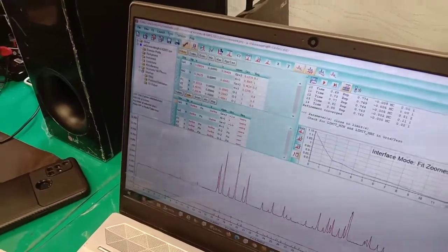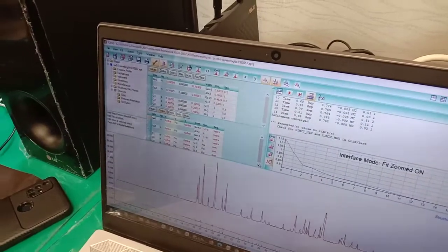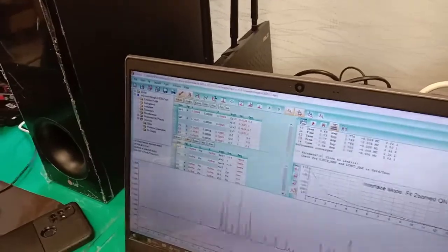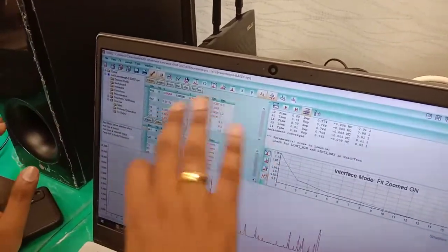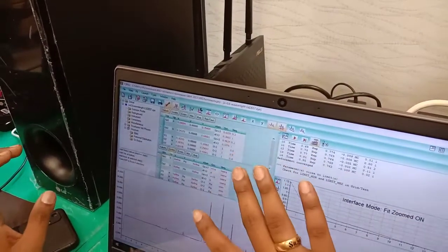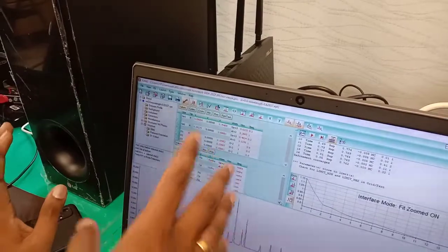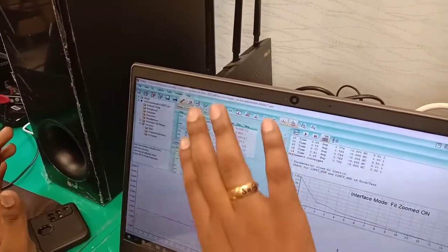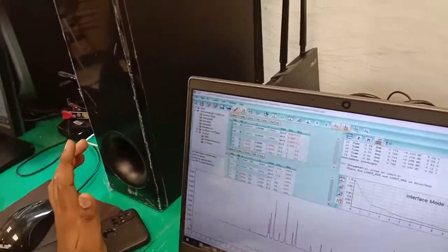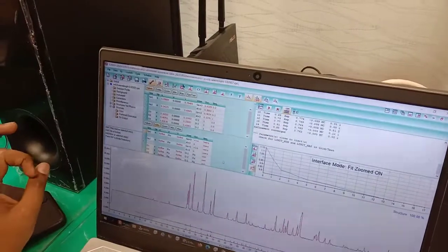Because everything has the same multiplicity, in this case I just refine it like this, because the OCC and the BQ are always highly related. So when I change the BQ, the OCC value will change. Sometimes based on our chemical formula we always set the BQ something like this, but I think it's fine. All should be open, sites and everything. Yeah, for BQ.